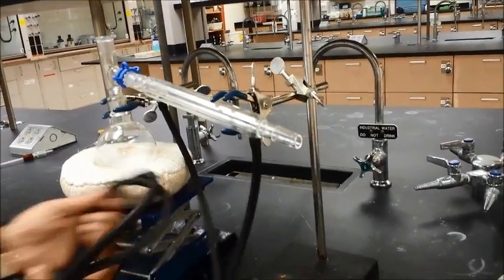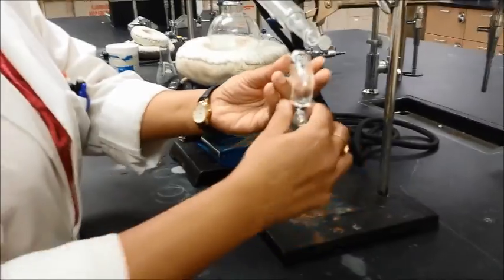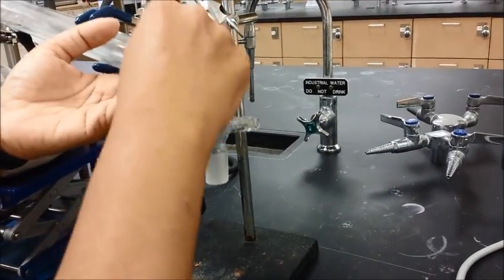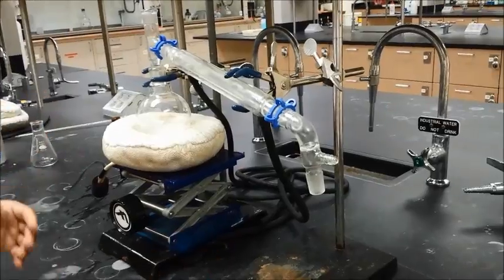Then get your vacuum adapter and place that on this side. This is where you will collect your liquids. Again, use a keck clamp — the small C goes on the small side — and it's all clamped. So this is your secure distillation apparatus. We're not quite done yet; we still have a little bit more work to do.